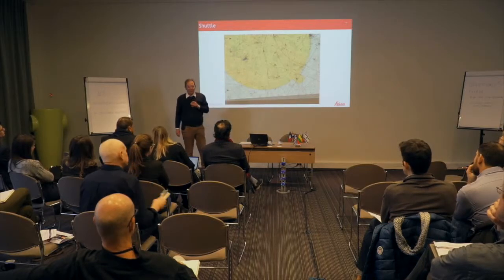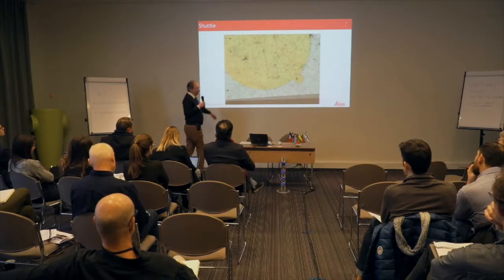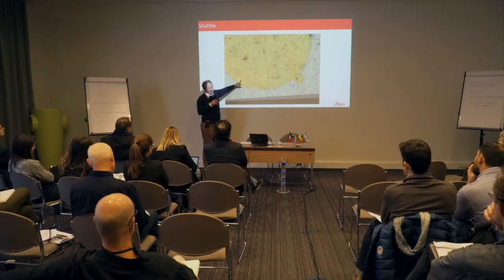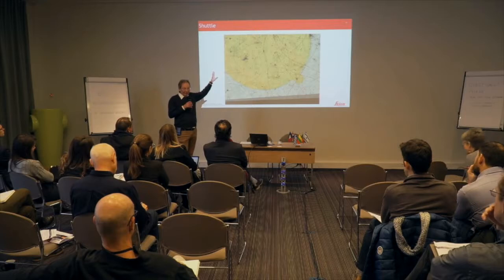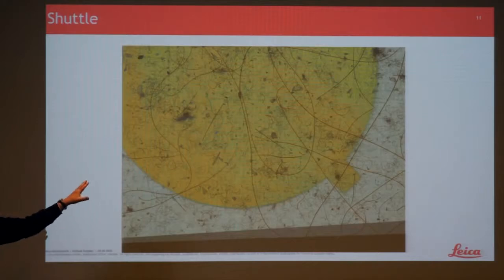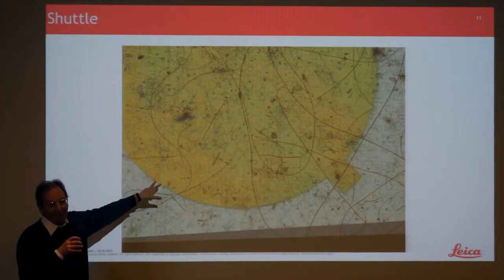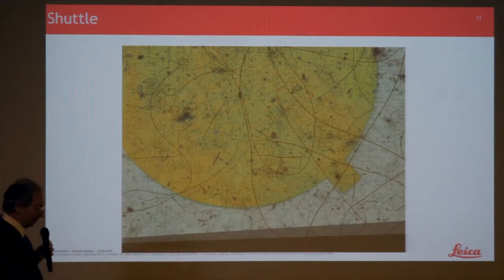And to make things worse, here you have again an overview image. And guess what? For those of you who do microscopy, this is a lambda plate. And normally, the lambda plate in a polarized light image should look magenta colored and not yellow. And this is just the fact that the tape itself has a huge effect on polarization. So I guess none of you want that. Again, this has lots of implication when it comes to the microscope.